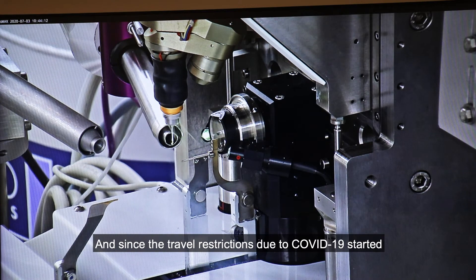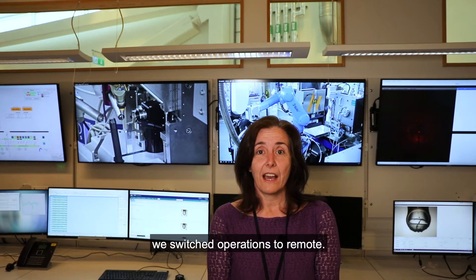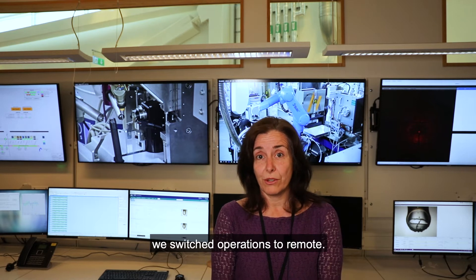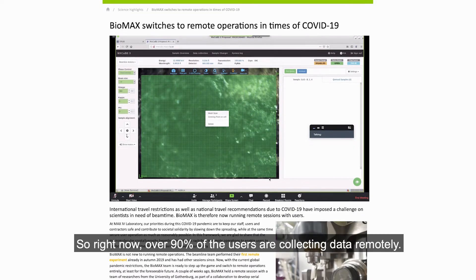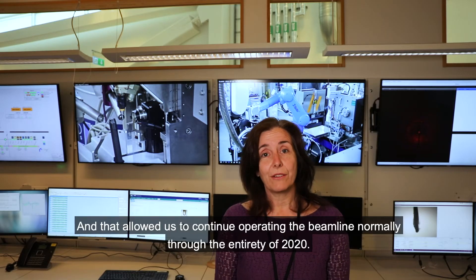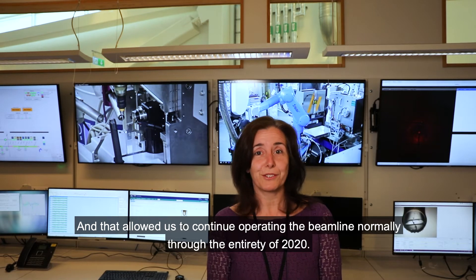Since the travel restrictions due to COVID-19 started, we switched operations to remote. Right now, over 90% of the users are collecting data remotely, and that allowed us to continue operating the beamline normally through the entire 2020.